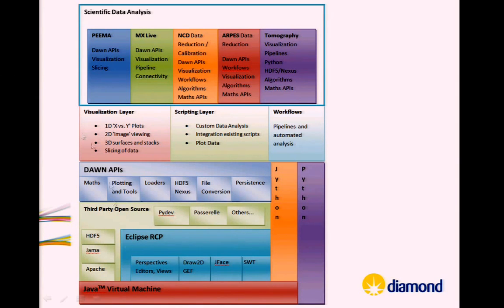So it is an Eclipse RCP product. The scientists themselves script it using Python mostly, CPython and also Jython. On top of the RCP framework, using existing third-party APIs and Eclipse APIs, we've developed our own APIs, the implementation of those are what we're going to talk about today.